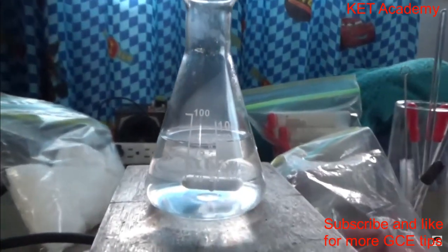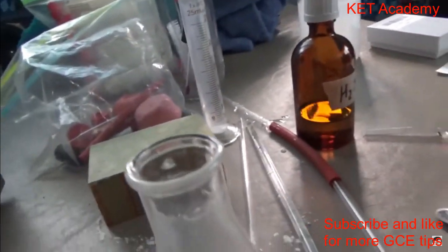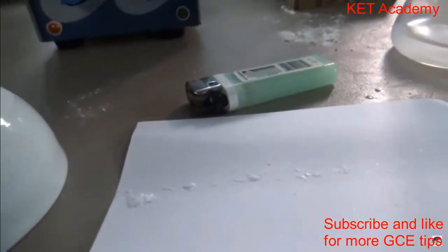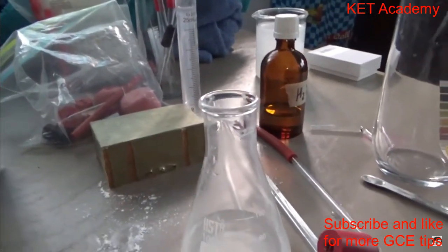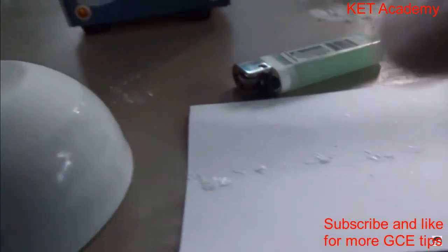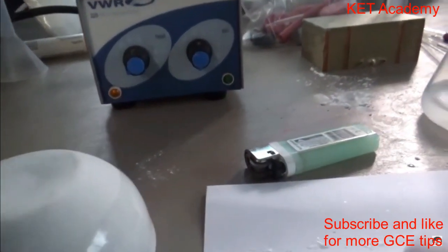We do have a carbonate here, which means that this is most likely potassium carbonate. That is what I was after before, and I didn't realize that crystals were being produced in my flask before. I thought I basically failed the last one, but I didn't. There you go. Potassium carbonate crystals. So that confirmed my hypothesis. We do have carbonate crystals, most likely.